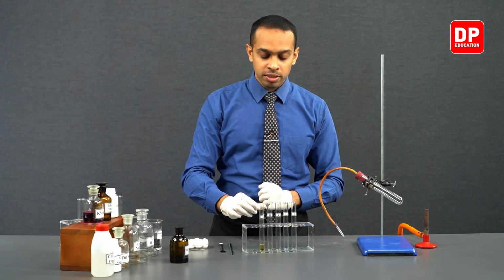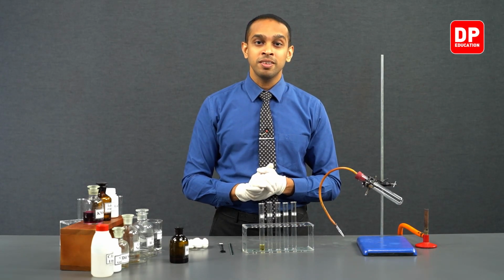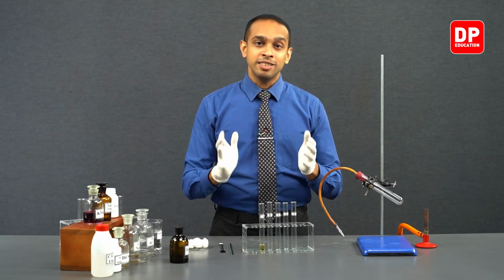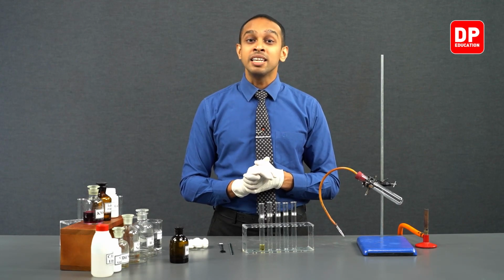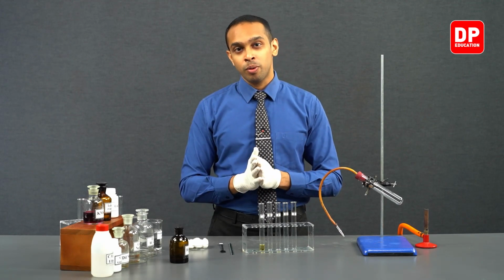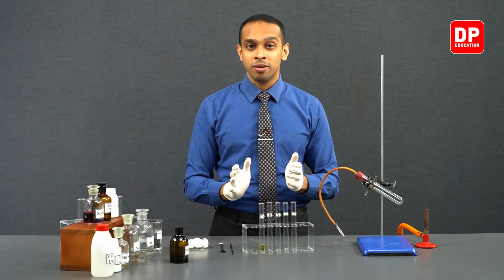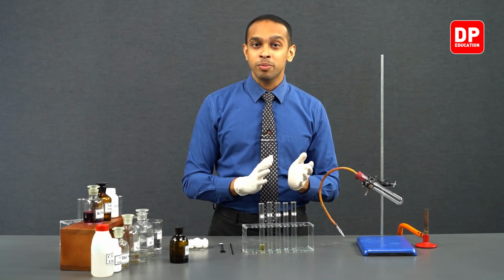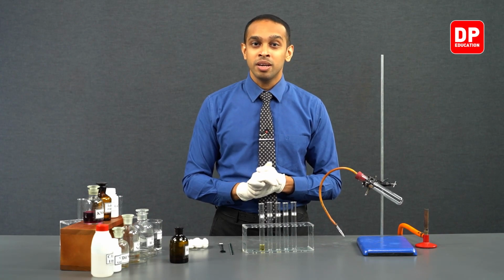Bromine water is used to identify the presence of unsaturated hydrocarbons. Unsaturated hydrocarbons are hydrocarbons that contain at least one double bond or a triple bond. In the presence of a hydrocarbon that contains a double bond or a triple bond, bromine will attach across the double bond or the triple bond.